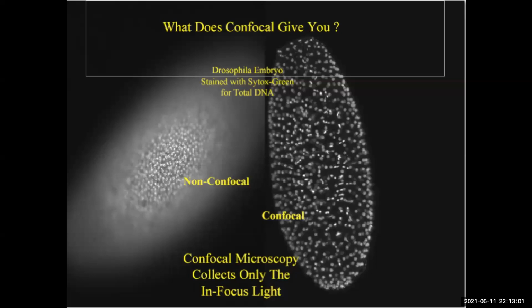And there's signal coming from not just two spots, but lots of spots, hundreds of spots. Each of these nuclei we're going to consider a spot. And when you're doing this in wide field, it's really hard to get things in focus, because there's always out of focus signal that is impeding you being able to just see one small plane.